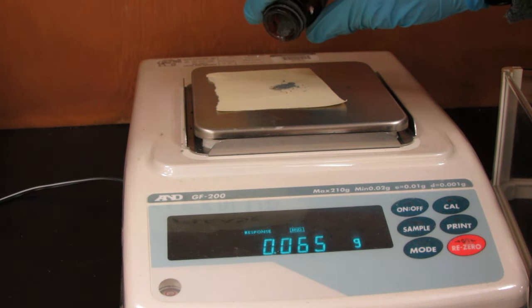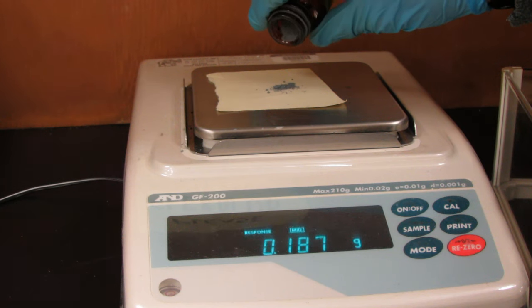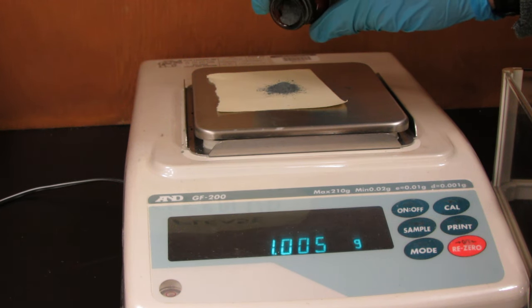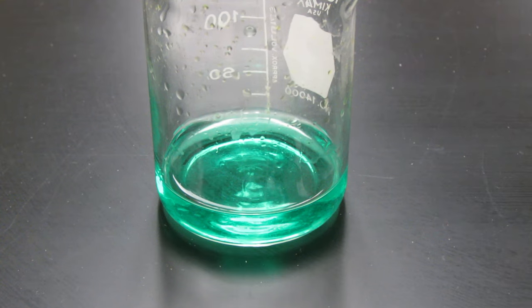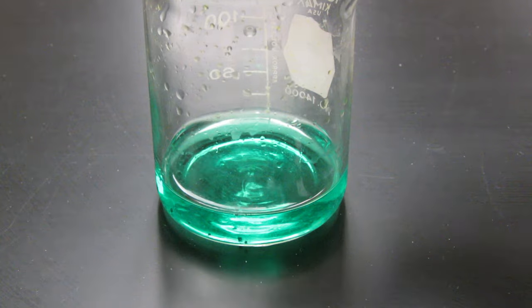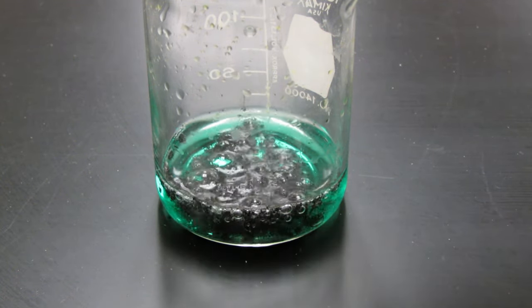Next, you need to weigh out one gram of zinc powder. Now add this to the copper chloride solution, and it should begin to bubble and react.